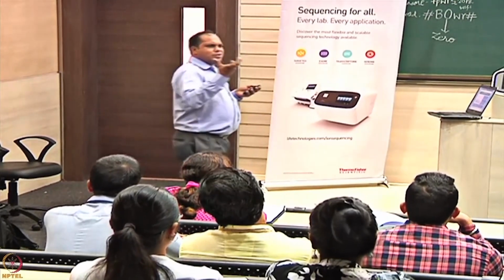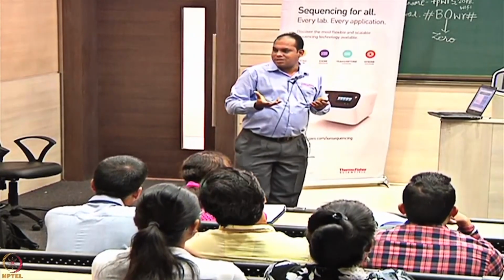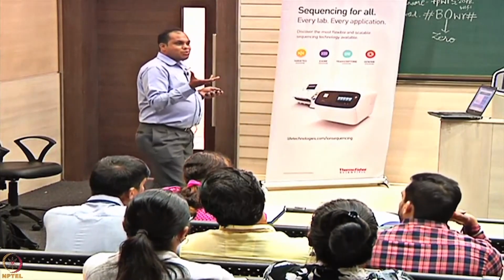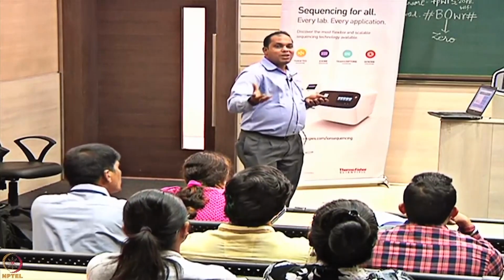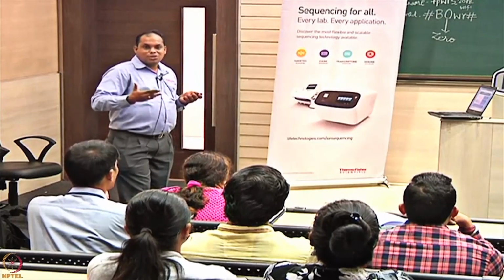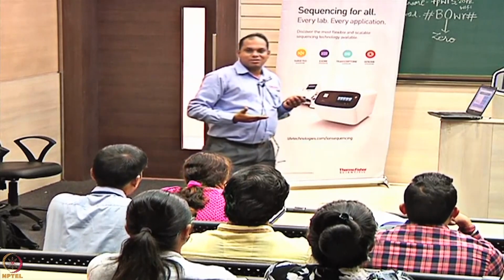Okay. There's a different technology. At the same time, we can do the same gene expression analysis here, where we like to target those genes which are actually in your expression studies. And we like to know which are actually highly expressing and which are actually low expressing. This could easily take you to the pathways which are affected due to these regulations.